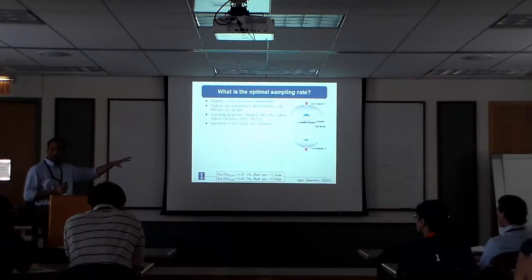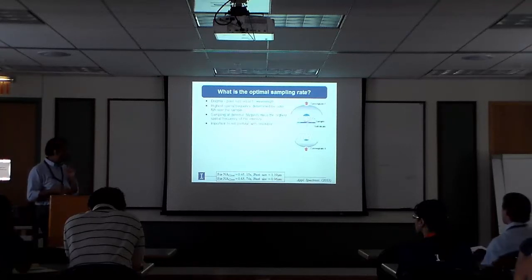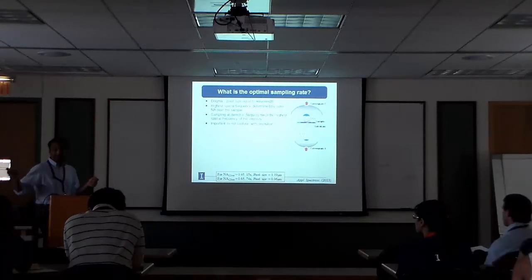So if you look at Rayleigh's criterion, it says, well, you've got 5 microns, you've got a 0.5 NA lens, you're probably at a 10 micron resolution. So all the instrument companies said, okay, I'll make my pixels 5 microns. I'll give you a little extra over there, and you've got that. But it turns out if you do this analysis, 1 micron is the answer you get. So what's right? Is it 1 or is it 5 or 10 maybe?